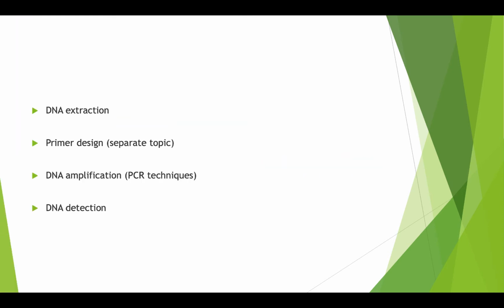فاللي أنا يعني المهم بالكورس كله شرحنا إلى الآن عشان نقدر نشرح اللي بنحكيه هلا حاليا. So we are getting an input that we're looking for, اللي هو DNA template that we're going to test, واللي هو عادة تحصل عليها من DNA extraction. So the template can be bacterial DNA, human DNA, viral DNA, مثل تحصل عليها من human cells مثلا إذا كان infected cells. So you have multiple types of cells from eukaryotes to prokaryotes that you need to use for DNA extraction. This is the template.